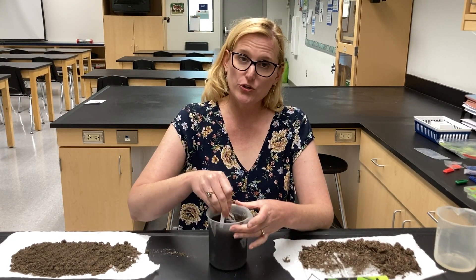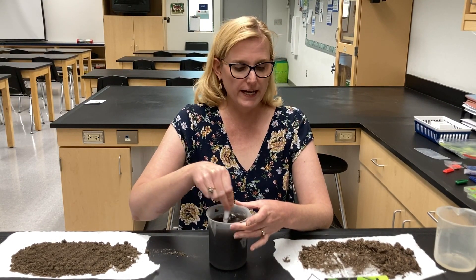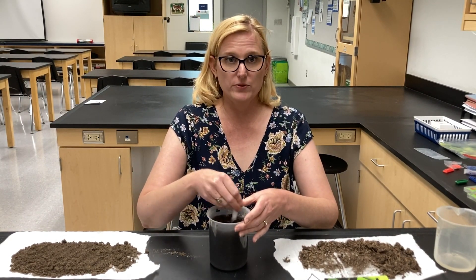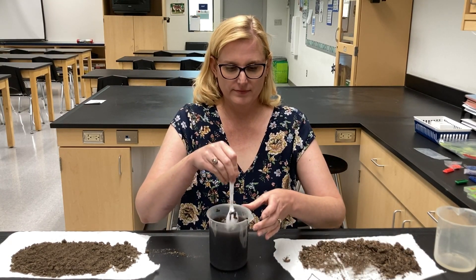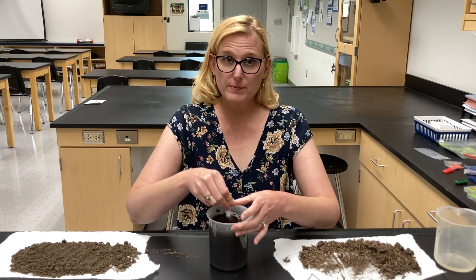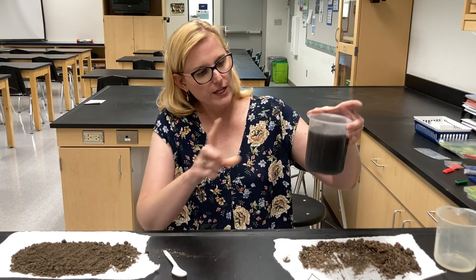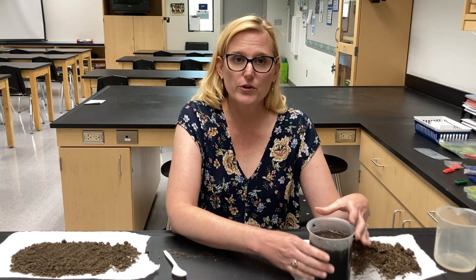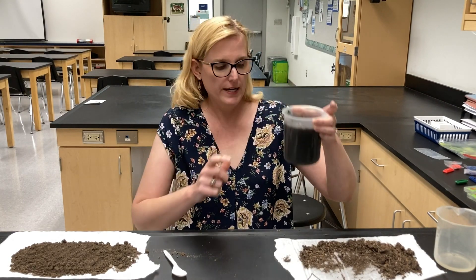I'm going to stir this for five minutes, then create the same mixture for the other two soil samples. After creating them, we let them settle for at least an hour. You want to get this clear liquid water at the top, and that might take more than an hour.